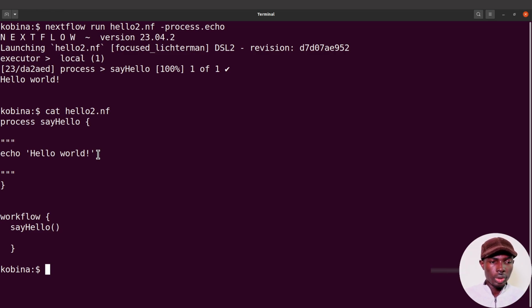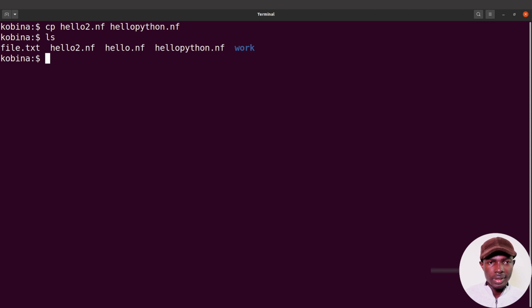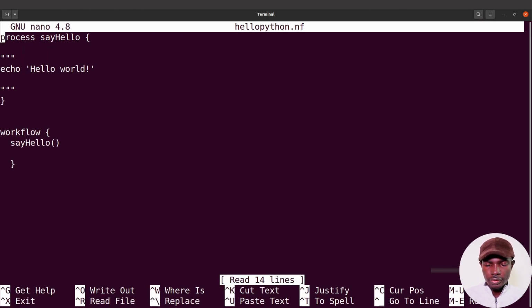Okay, so let's continue. Now let's just copy the scripts. I'll copy the hello2. You can also copy the other one. I'll just say hello python.nf. That's what I'll use. All right, I'll do an ls. So I have that also copied. I am going to edit it and show you how to add that information.